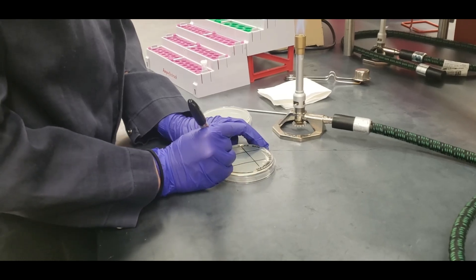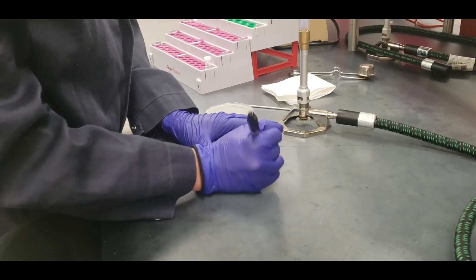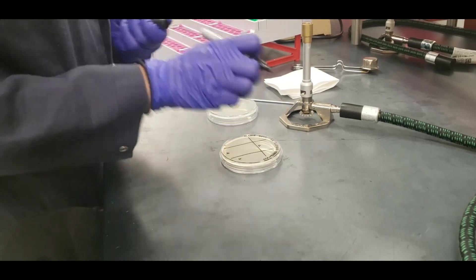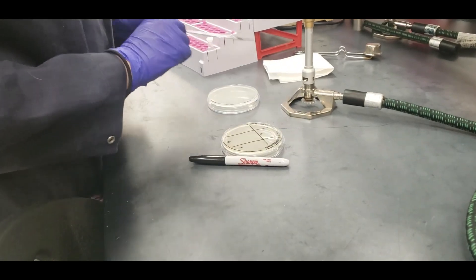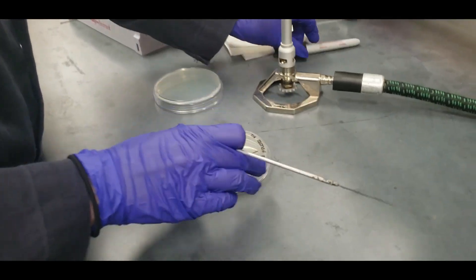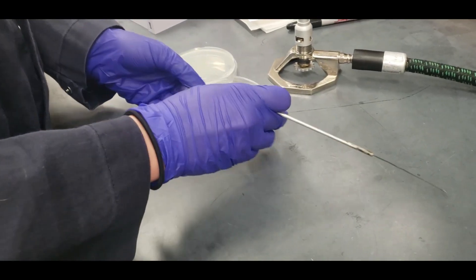So label your quadrants one, two, three, and four. And you're going to repeat the same steps like you did for making your three-quadrant plate.